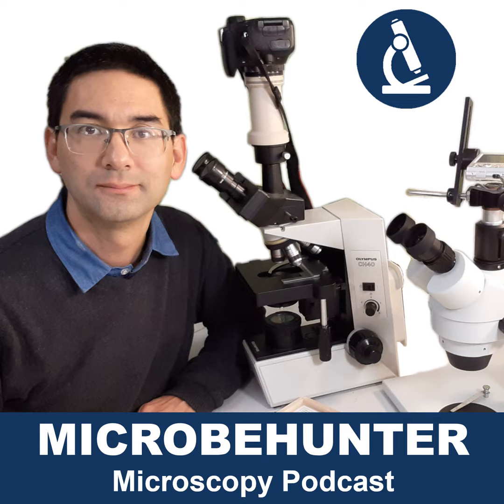And last but not least, we just talked about photographs. Yes, of course, there are also competitions about microphotography. No, this was wrong. Microphotography is actually a wrong term. You have to say photomicrography. That is the correct one. Okay, microphotography is actually not right. A photomicrograph is a picture taken through a microscope. And if you say a microphotograph, then this is a photograph which is too small to be seen. It's a microscopic photograph. So we've got to be careful here, but I know that's a little bit not so relevant right now.